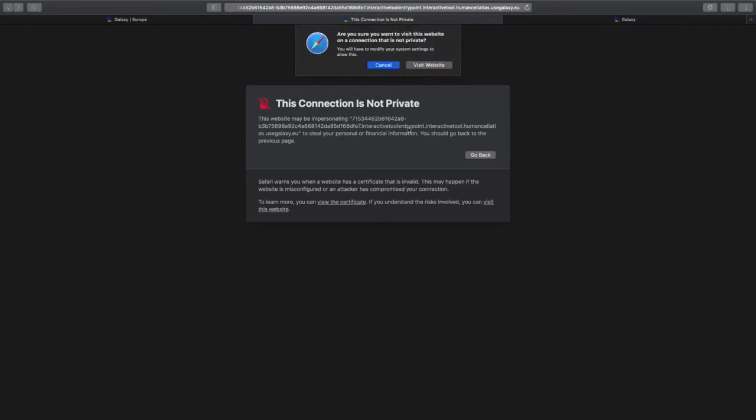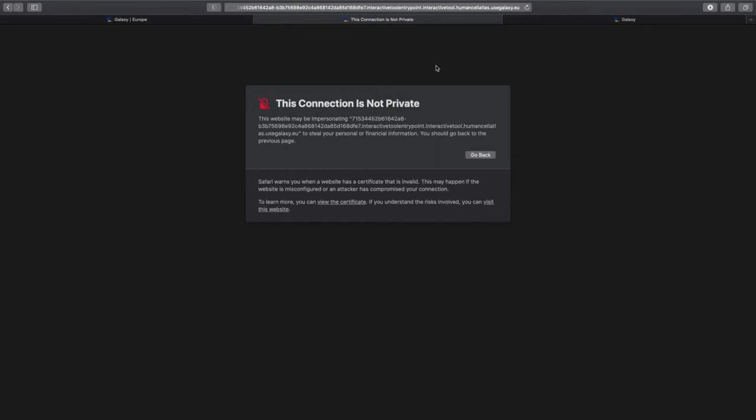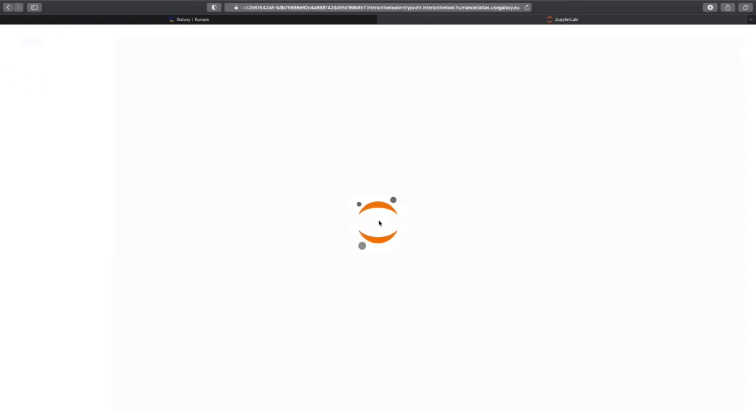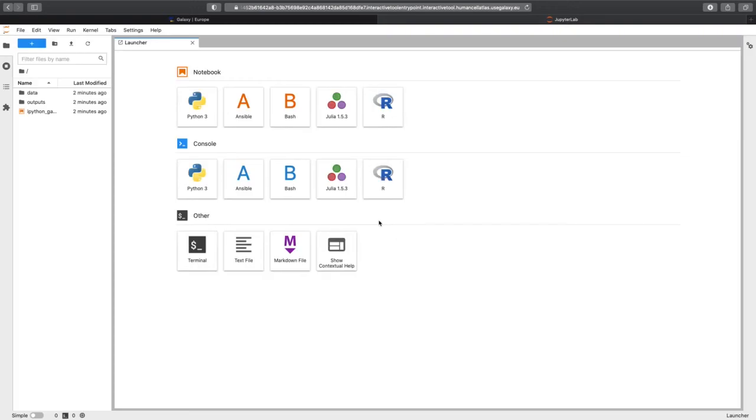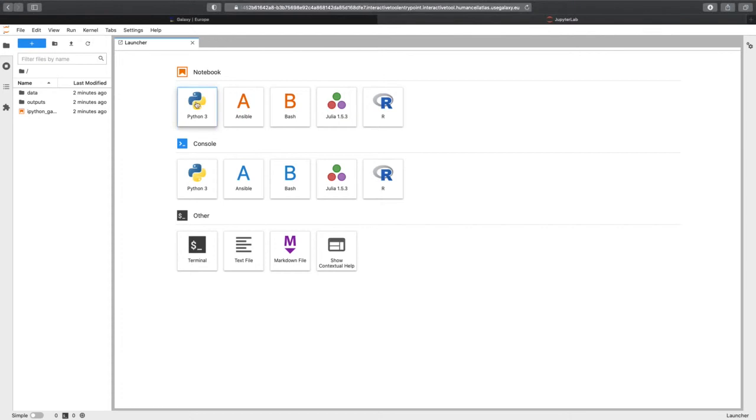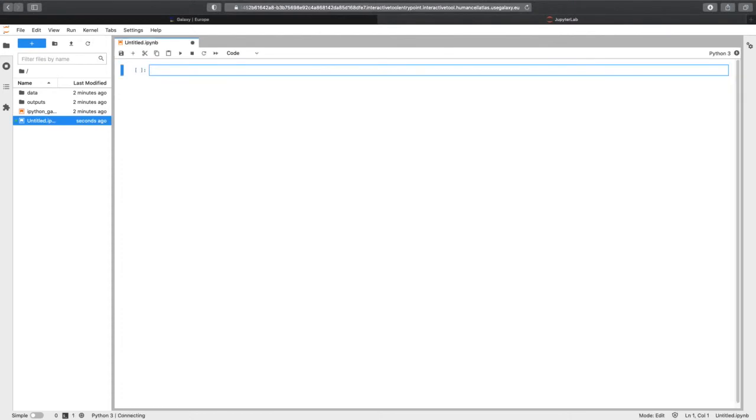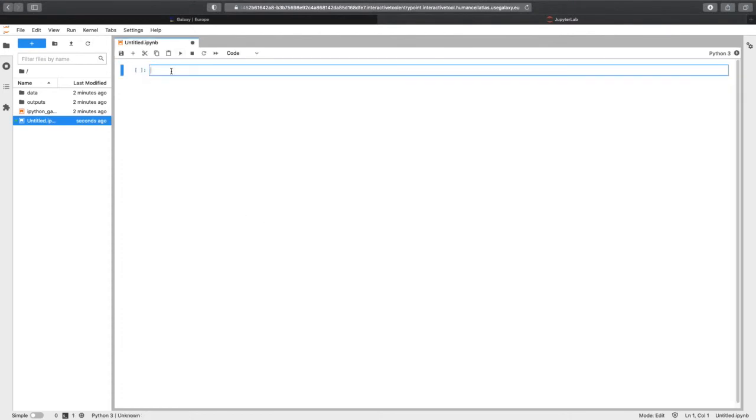It always does this to me. It's absolutely fine. I don't know why. Woo, we're in. We're on the Python 3 link. Okay, and then we're going to save it.